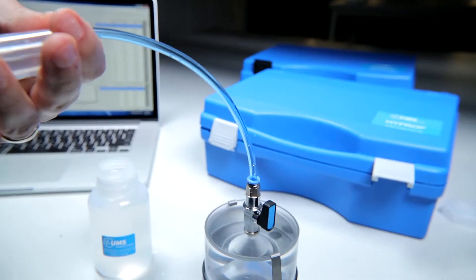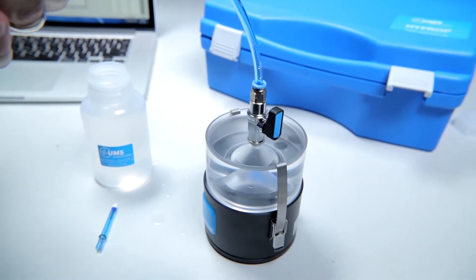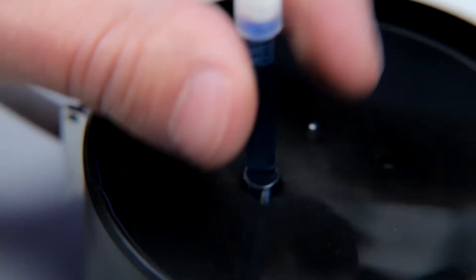Remember when you're using the HI-PROP that you're using very sensitive pressure transducers. As you're refilling the HI-PROP or during normal use, it's important not to over-pressure or shock the pressure transducers. When refilling, make sure you keep the pressure under three bars.